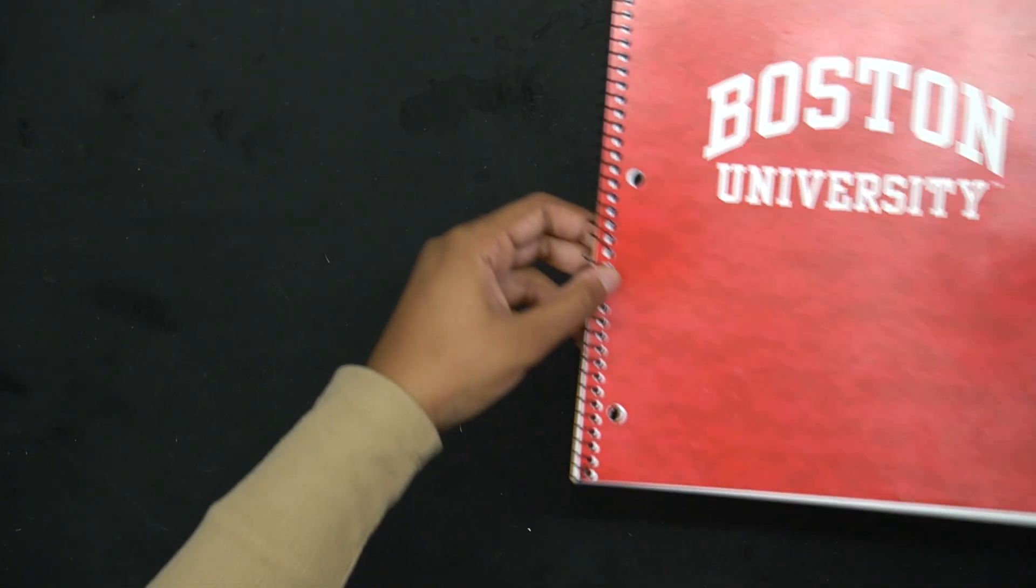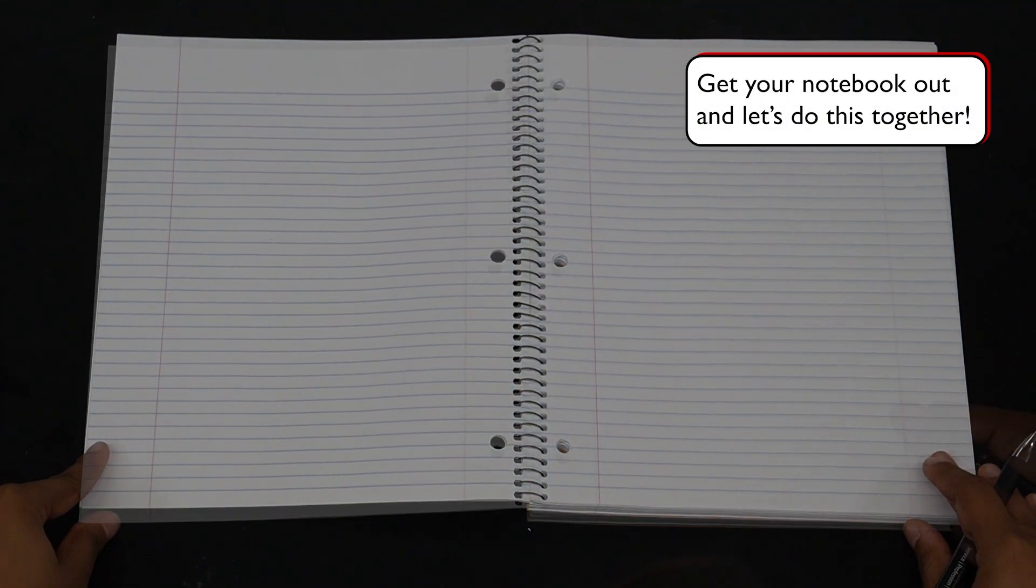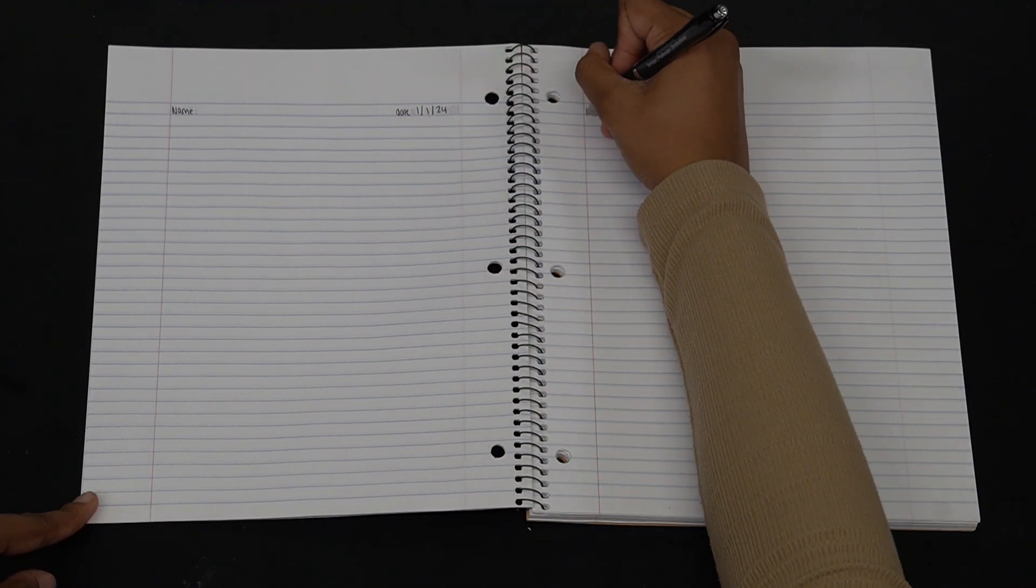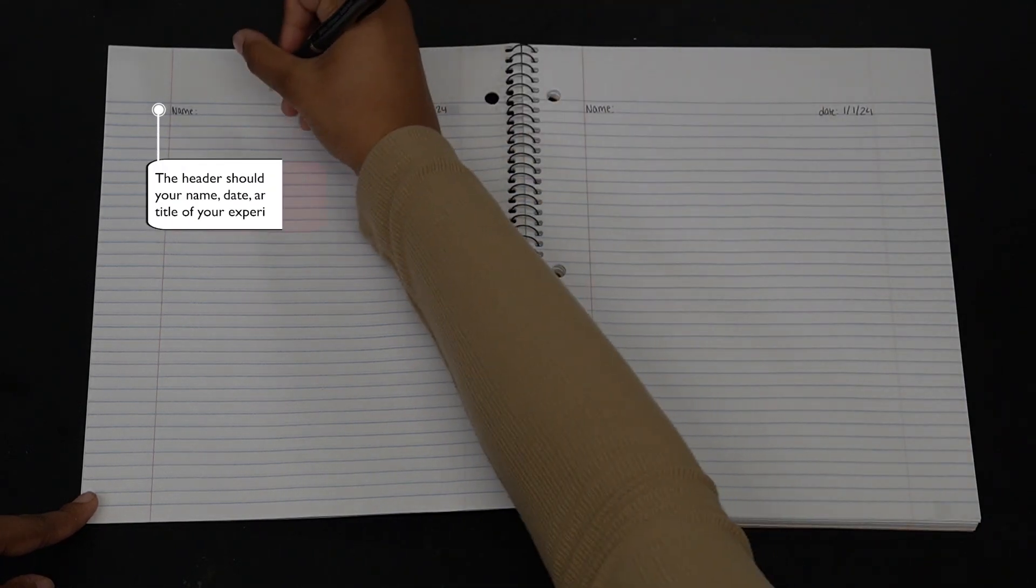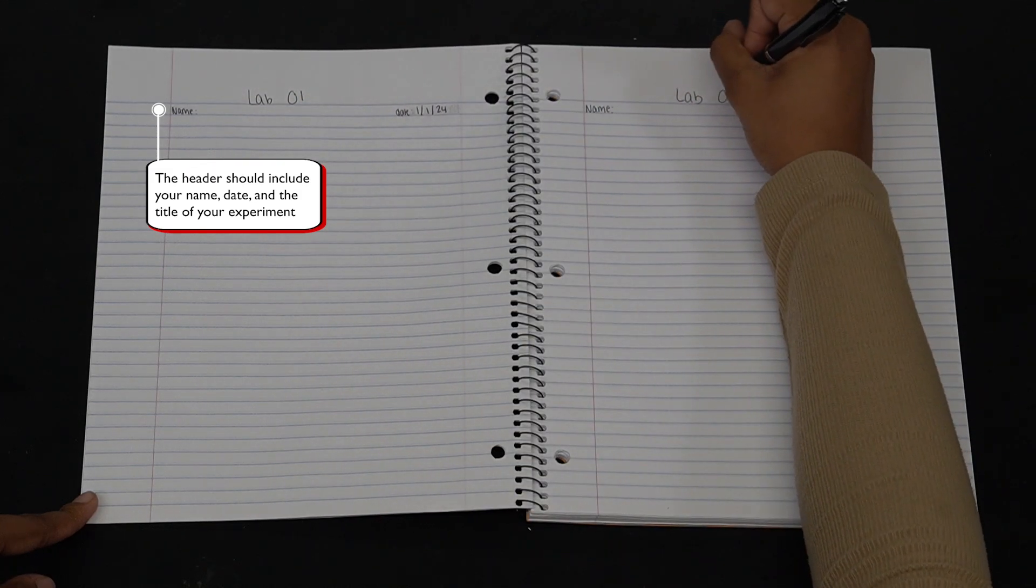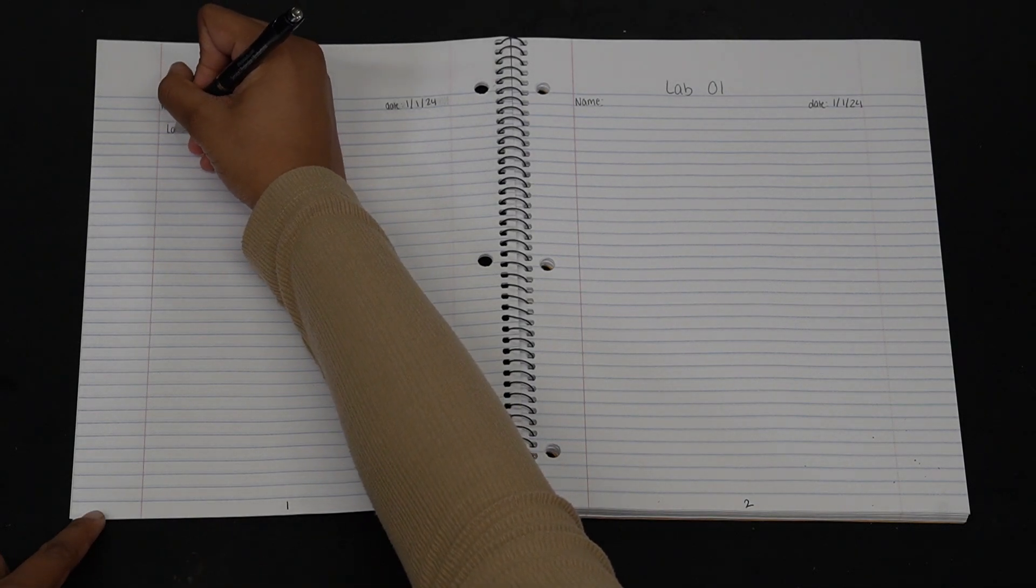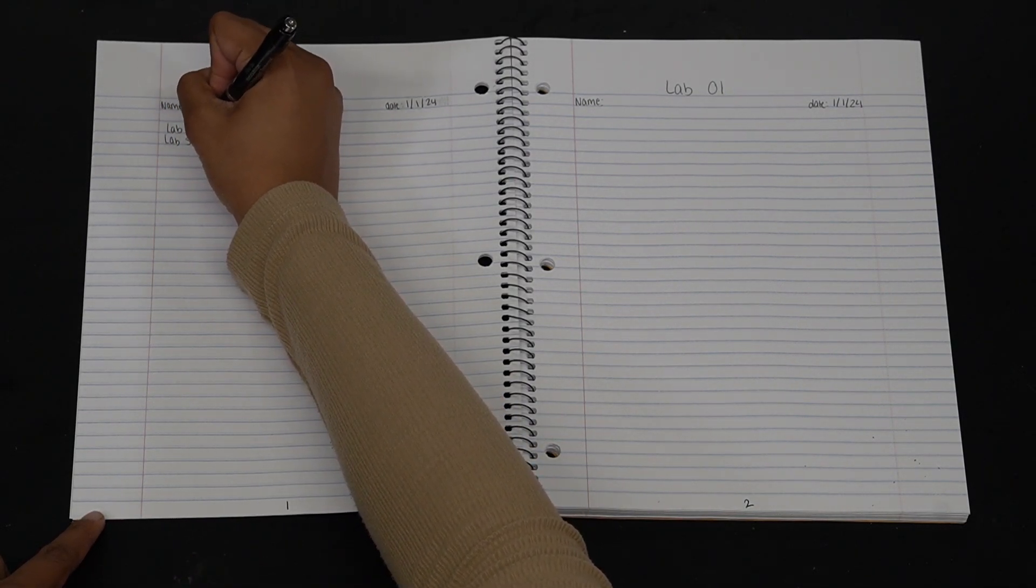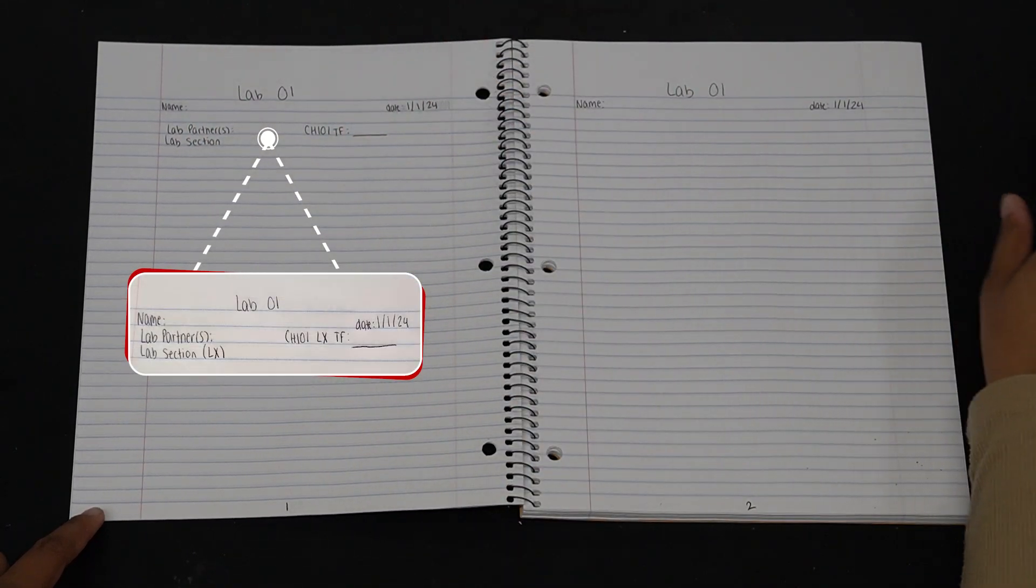Now that we have the right tools, let's talk about the general organization of the notebook pages. If you are preparing your notebook for an upcoming experiment, we recommend that you start writing your notebook pages as you are following along with this video. First, each page of the notebook should include a header and a footer. The header should have your name, the date of the experiment, and the title or number of the experiment. The footer should include the page number. At the top of the first page, we should leave space to write down our lab partner's name if you work with one for the experiment and the name of your lab instructor.